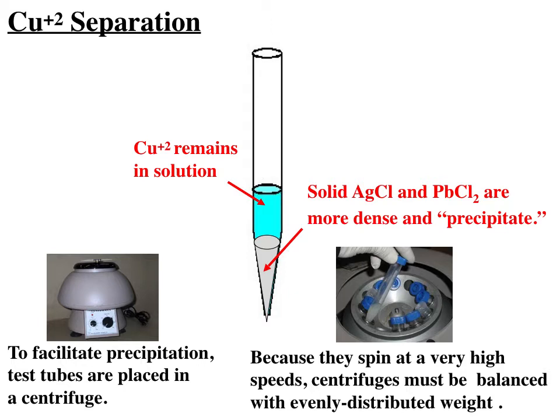So with a pointy tube, the volume occupied by the precipitate will look more dramatic. It is still easy for a chemist doing a separation technique of this type to recognize that there certainly is some precipitate present, separated from the supernatant above.